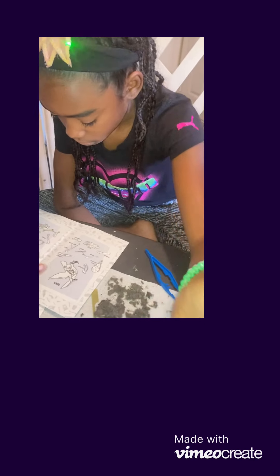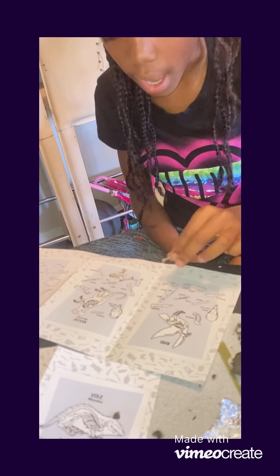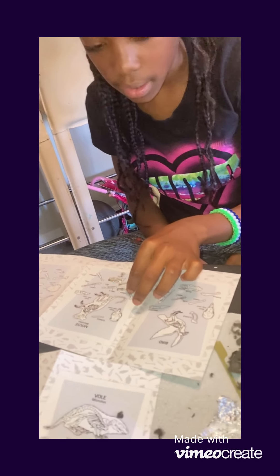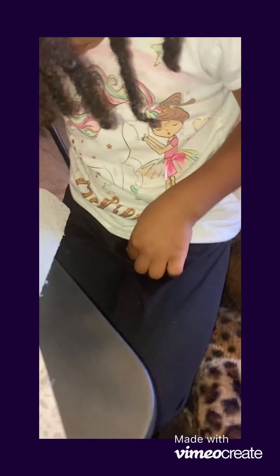I'm starting to think this is a bird too, because I don't really see a piece. I see another piece right here though. I got these two pieces. Ew, you got the mouse on you!